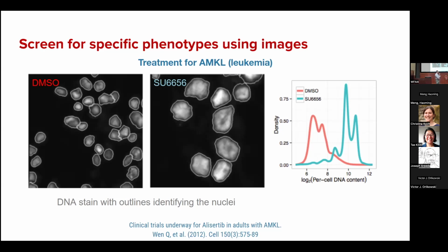This is a very nice example for several reasons. It's easy to visualize, like any person that can look under the microscope can tell whether the cell size is growing, but nobody is going to have the patience to do that manually and every time check under the microscope, because there are, again, thousands of potential chemicals that you could use, and we don't know a priori which one is going to work.